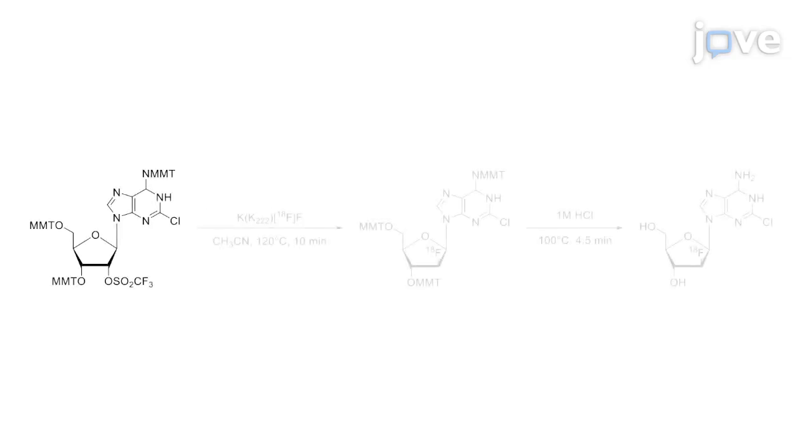To create an automated synthesis program for the PET tracer fluorine-18 labeled Clofarabine, or CFA, the precursor is first reacted with dried activated fluoride-18 to form the intermediate, followed by removal of the protecting groups to form the final compound.